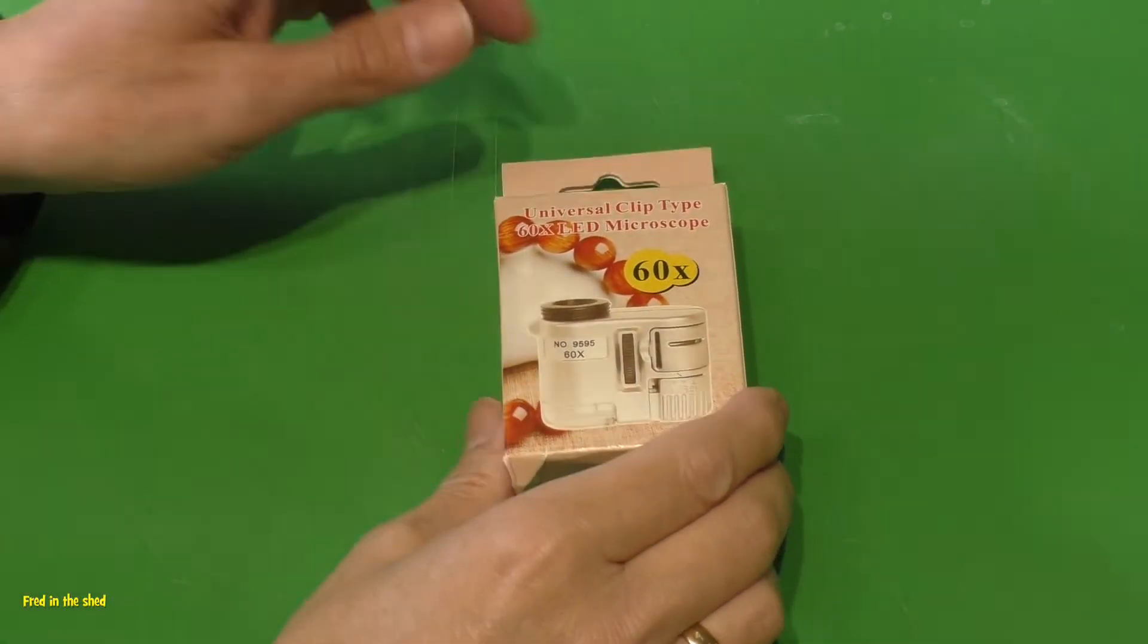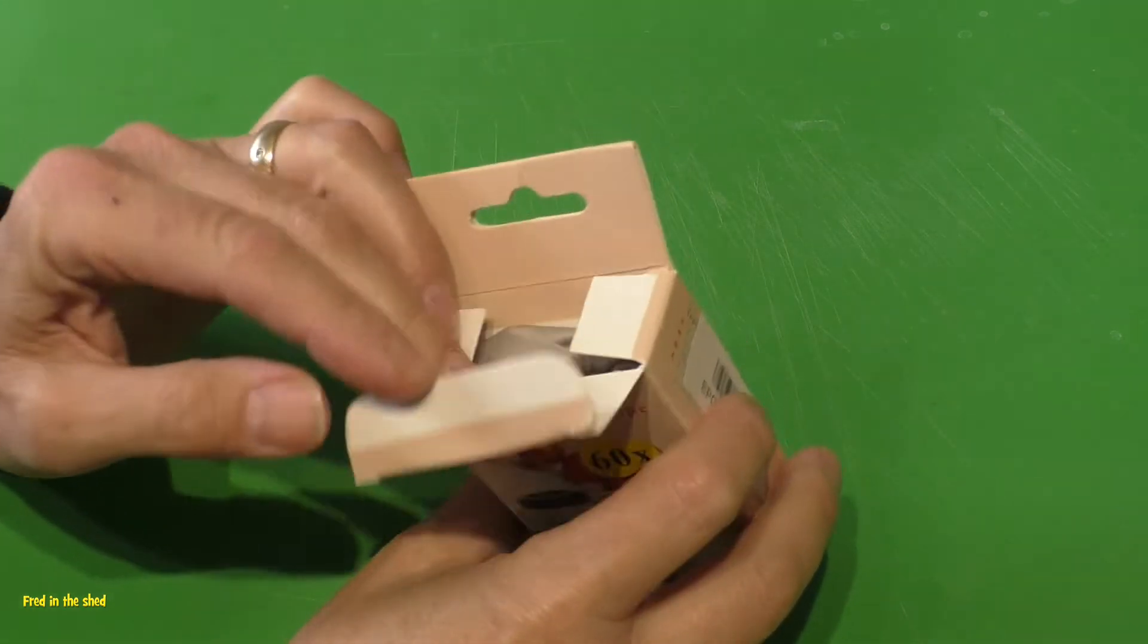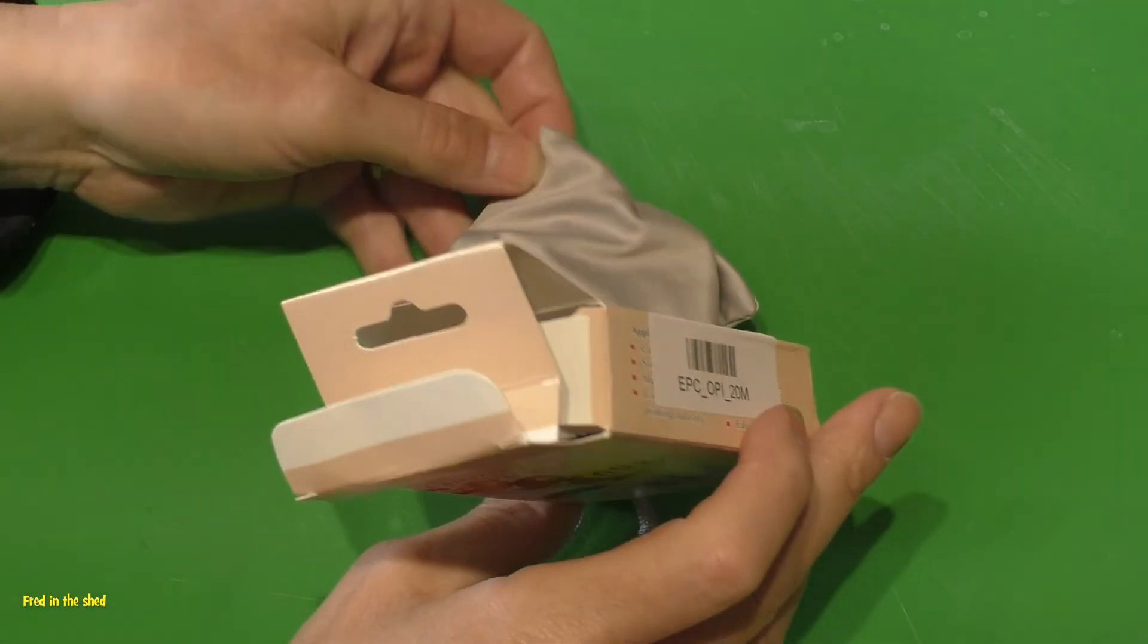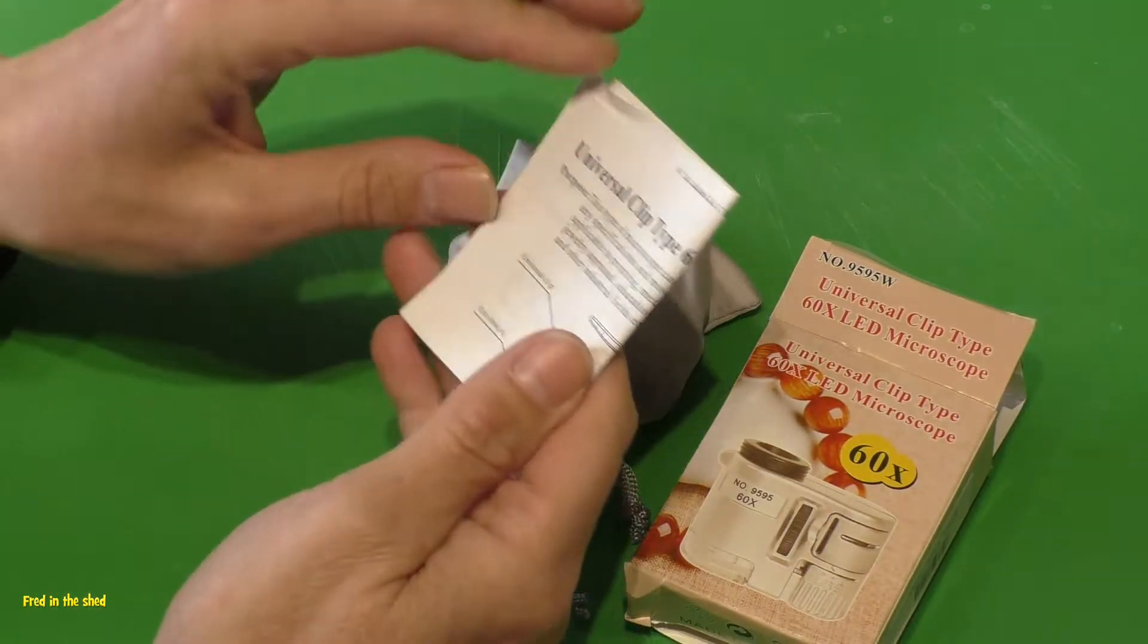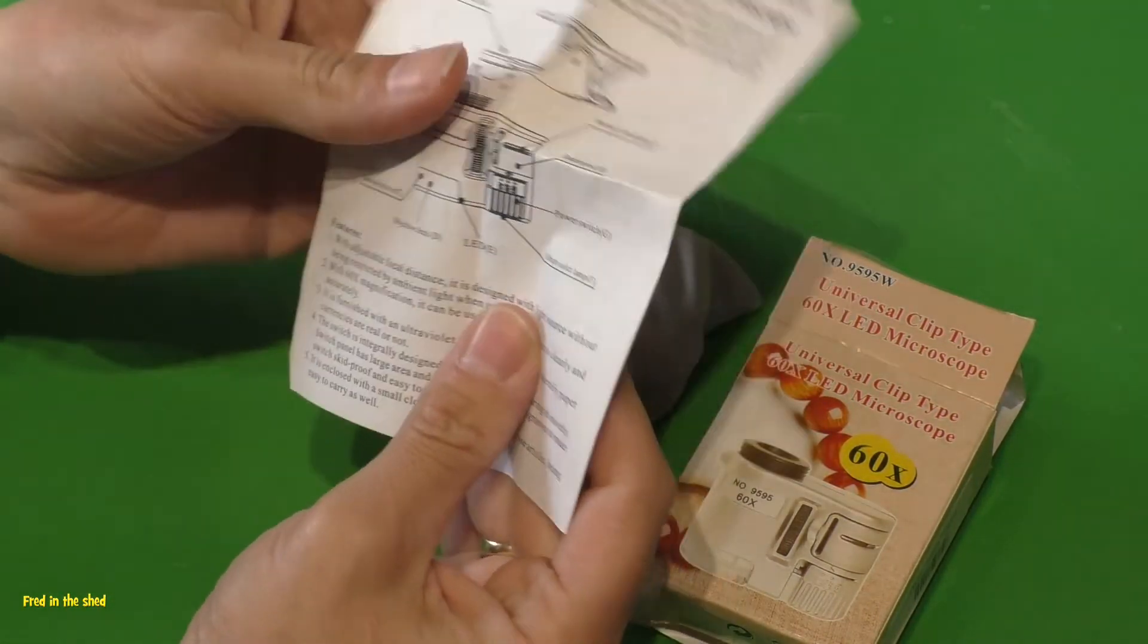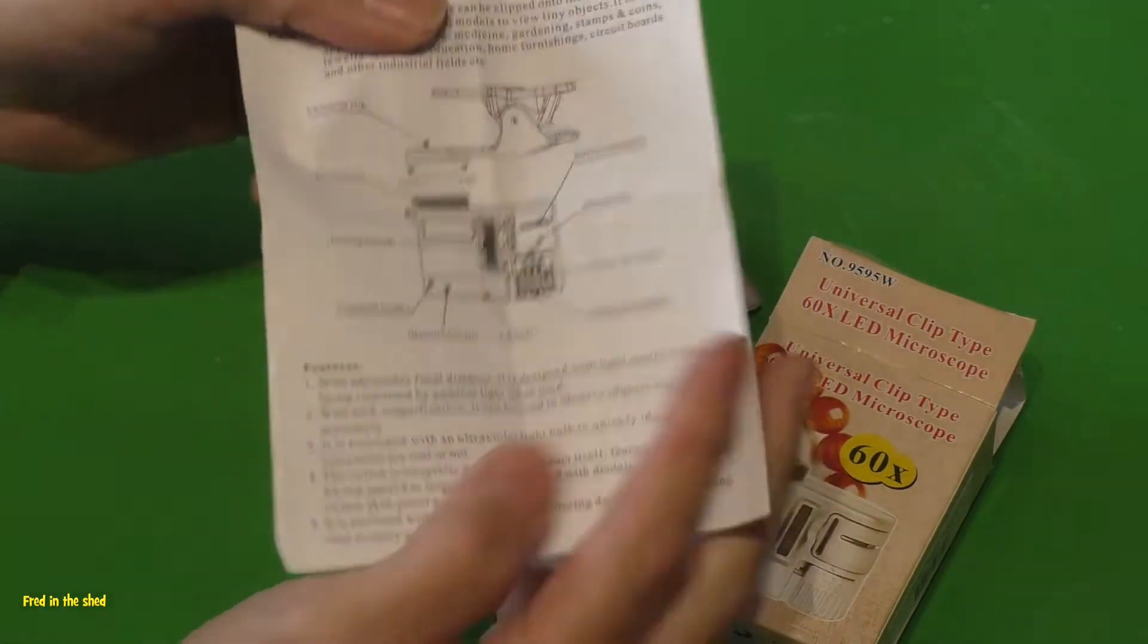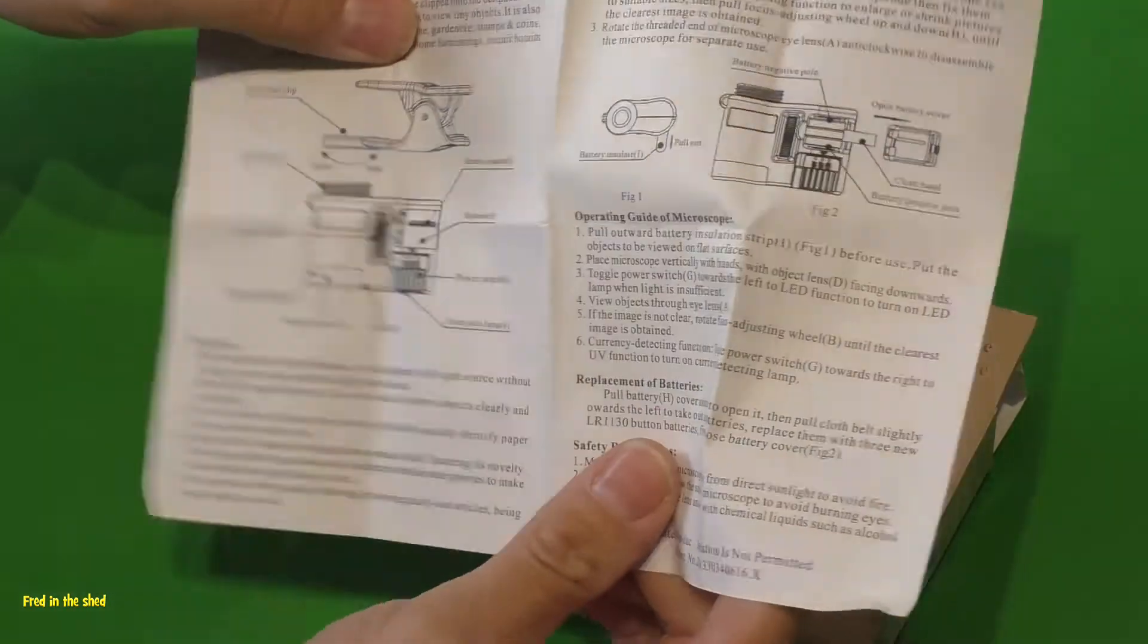This is the device. Because it was from the UK, I think this came from Birmingham or something like that, it arrived a few days after I ordered it, so no need to wait the normal month that you get from China. Inside, very much a Chinese product of course, comes with some instructions. You know what I'm like with these pigeon English instructions - these ones are sort of okay, there's lots of mispronunciations and spelling mistakes, but it gives you an idea how it works.